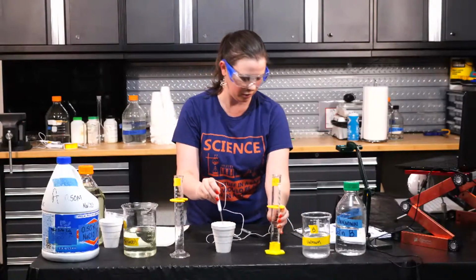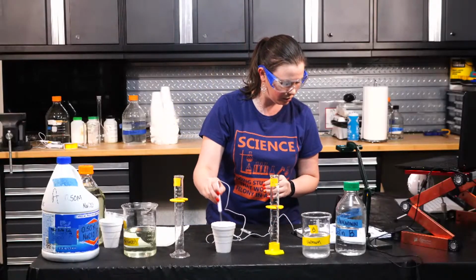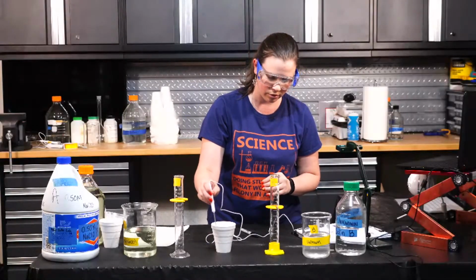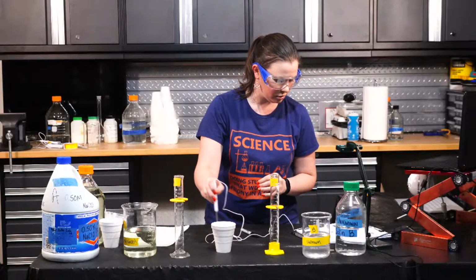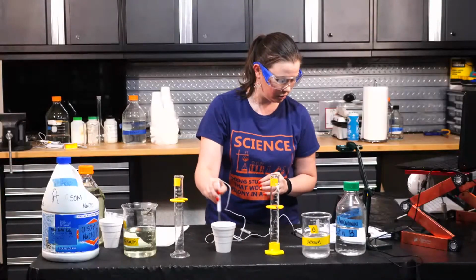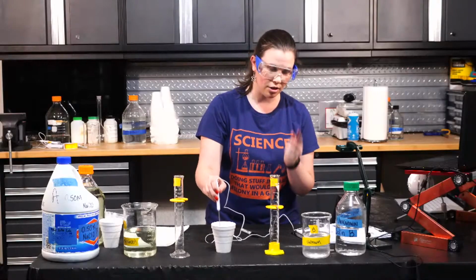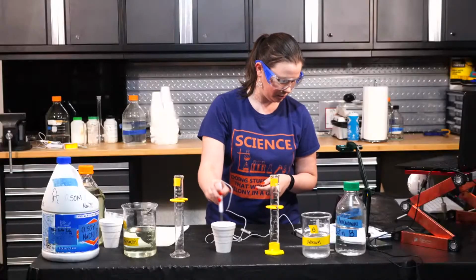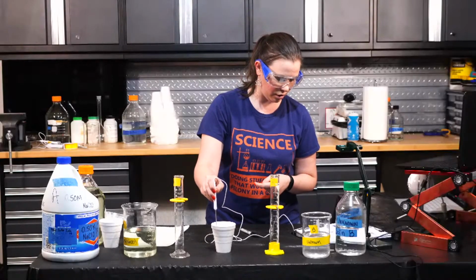All right, give it a little stir. 29.7, 29.8, 29.9, 30.0, 30.0. Still 30.0. Keeping my agitation consistent, right? 30.0. Still no change. So I think I'm going to call it. Maximum temperature for level 3, 30.